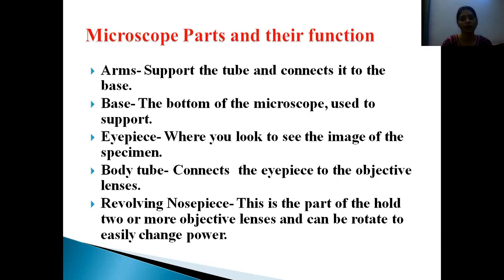Microscope Parts and Their Functions: First, the arm supports the tube and connects it to the base. The base is the bottom of the microscope used to support it. The eyepiece is where you look to see the image of the specimen. The body tube connects the eyepiece to the objective lenses. The revolving nosepiece holds two or more objective lenses and can be rotated to easily change magnification power.